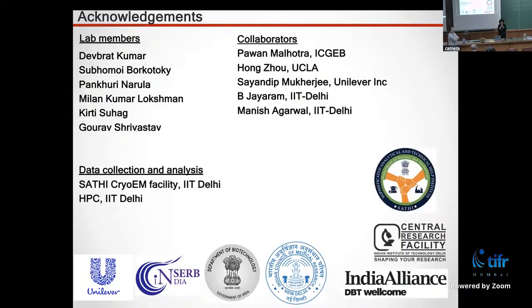I have another short question on the viral disassembly. Disassembly happens in the late endosomes, I believe, and there are huge pH changes. Is it possible that the C2 axis is where the cracks are being opened? Are there any protein residues which might be pH dependent, so that you have huge changes there? Good question, but we tried to do this analysis with residues at C2, quasi C2, C3, C5, everywhere, and we don't see a distinction which would make the C2 the preferred destination. So we don't really know what that would be.